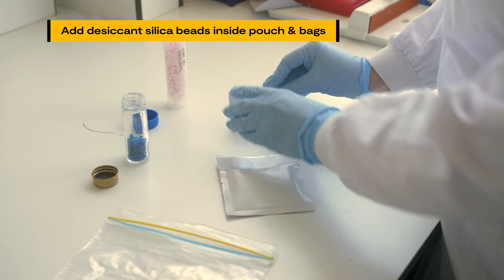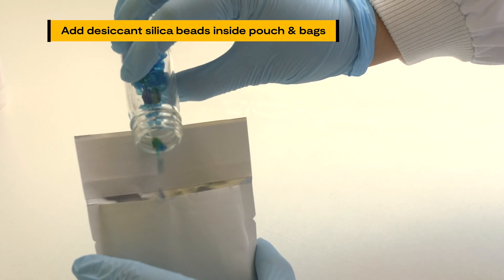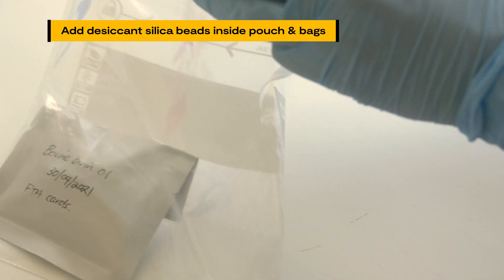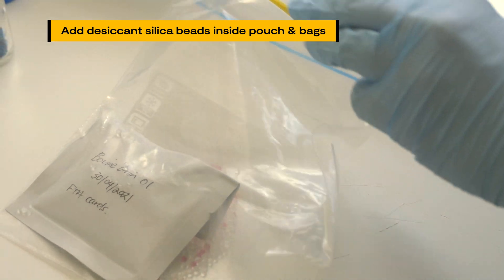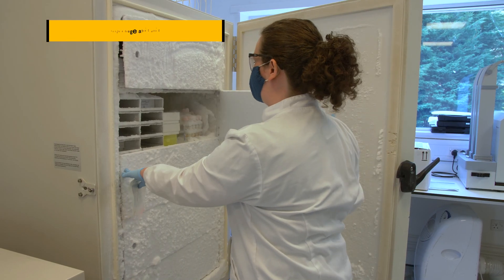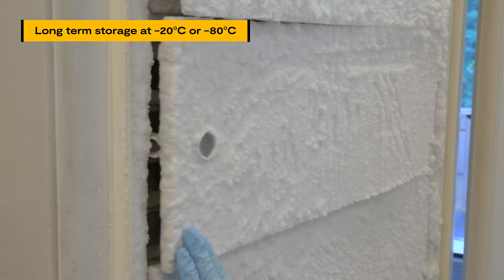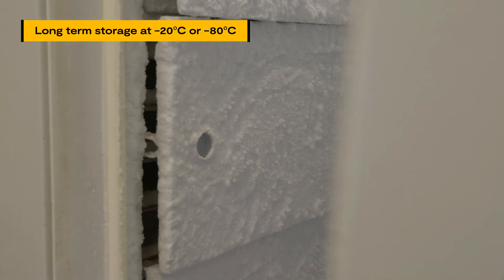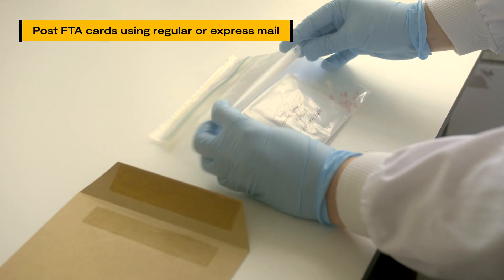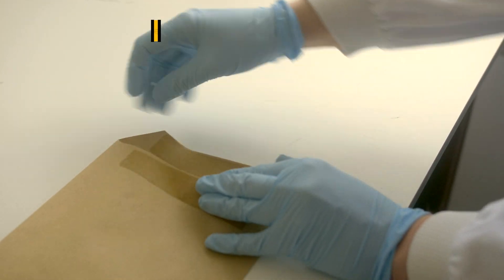Completed samples can be stored together in a pouch or in Ziploc bags. It is highly recommended to insert desiccant silica beads inside the pouch to keep the cards as dry as possible. For long-term storage, it is recommended to store the cards in the Ziploc bag with the desiccant in a frost-free minus 20 degrees Celsius freezer or a minus 80 degrees Celsius freezer. Sample FTA cards can be posted using regular or express mail without the need for specialised packaging.